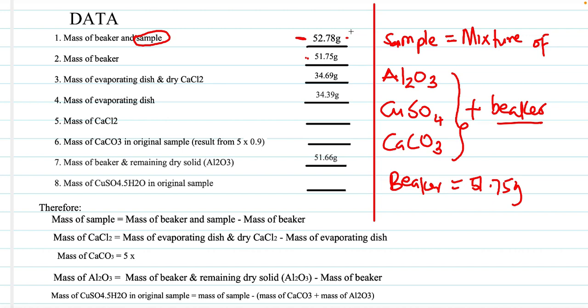You can decide to copy everything I have here, because this is the value I got from one person in the lab, and based on what I'm hearing, most persons did not conduct the experiment. You were asked to get data from your colleagues. So even if you recopy everything here into your manual, you will not be penalized. Instead of copying what you're not very sure of, I can assure you that this will still get your mark.